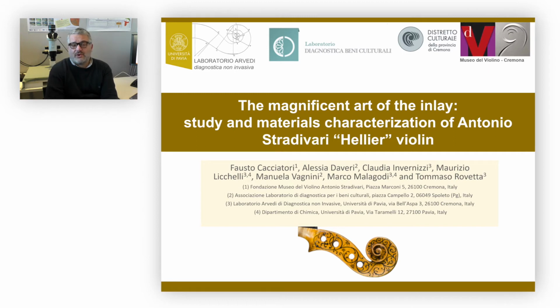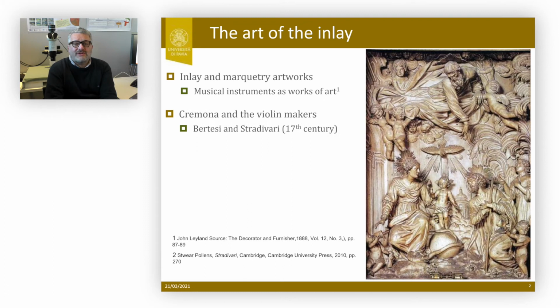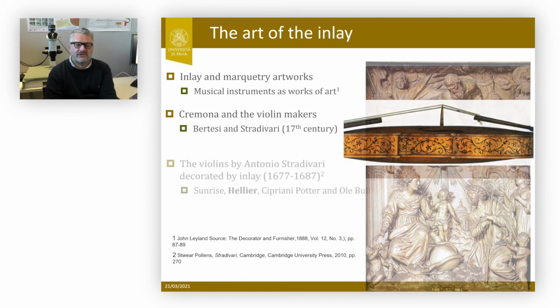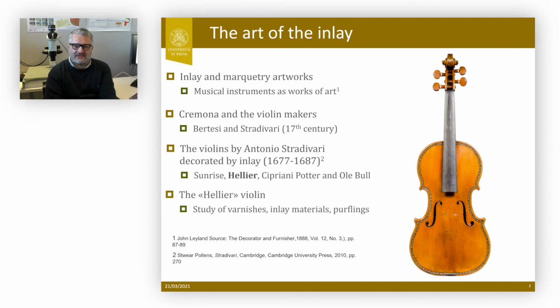One of the most important violins that we analyzed is the Hellier violin made by Antonio Stradivari. It is one of the most important violins in the world because it is totally decorated by inlays. And what we tried to do using the ELIO instrument was to characterize the elements present both in the varnishes of the top plate and the back plate, and even in all the inlays and purfling present in the violin.